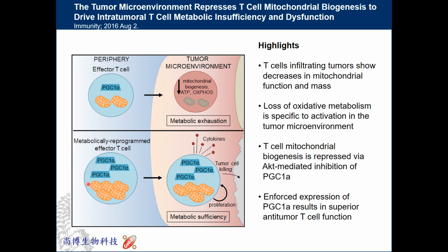So with these mitochondria, the T cell can live well inside the tumor microenvironment and work normally. So we can release cytokine normally, we can proliferate normally, then we can kill the tumor cell. So let's try to prove it with the Seahorse analyzer.